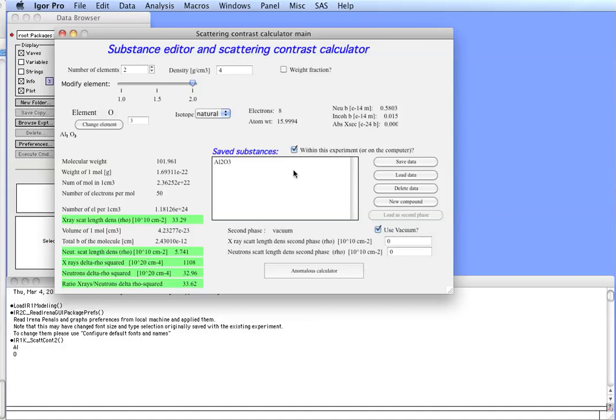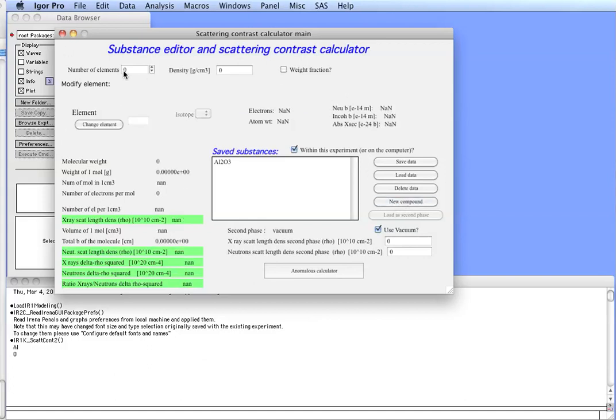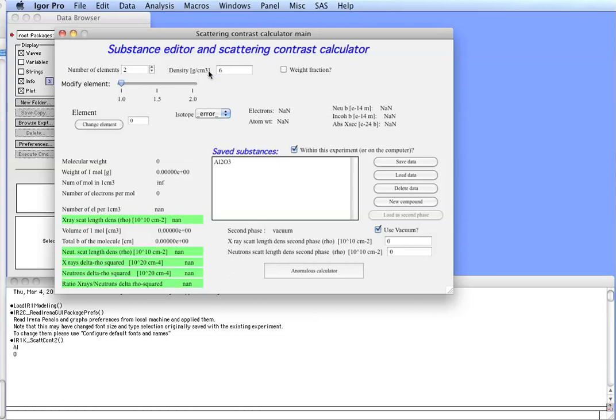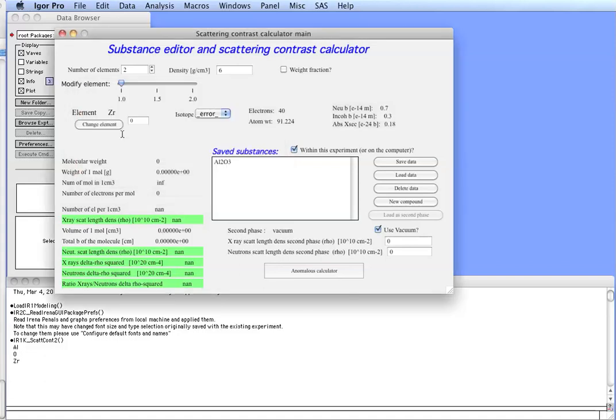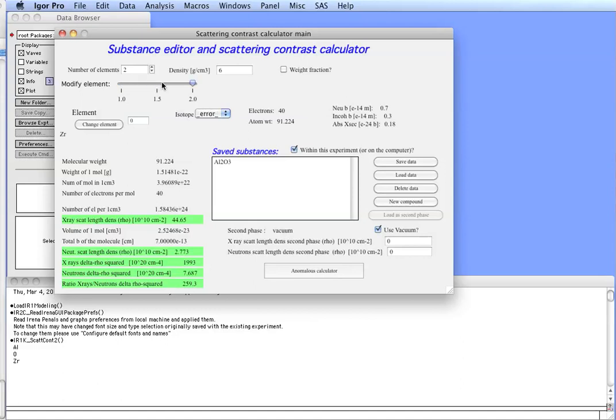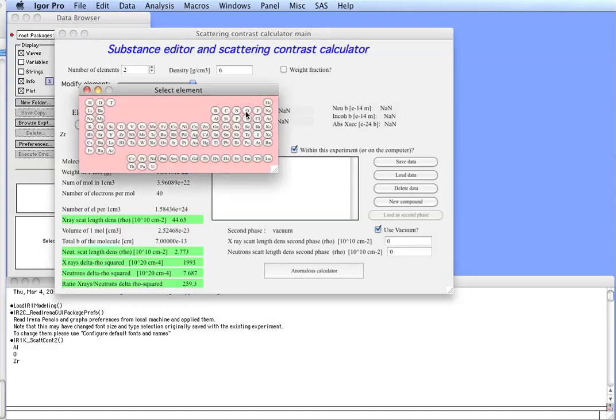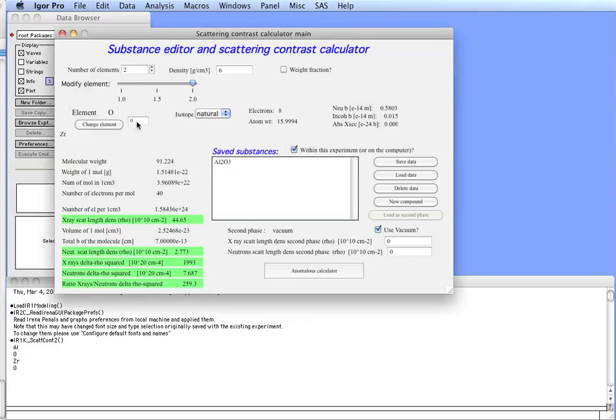For the next step, let's create zirconium oxide. So, we have something which we can work with in anomalous calculator. So, let's hit button New Compound. That will clean up the tool. And now we think about that. Zirconium oxide is ZrO2. So, we need again two elements. The density, I think, is about 6. Modify element change. We need zirconium, which is here. It's zirconium 1. Then we want to go and select element 2. ZrO2. Oxygen. And ZrO2.